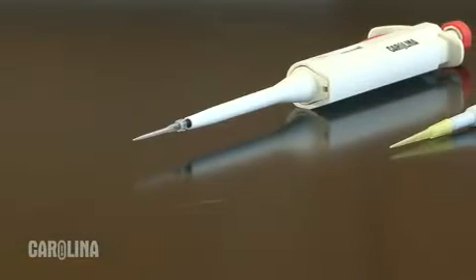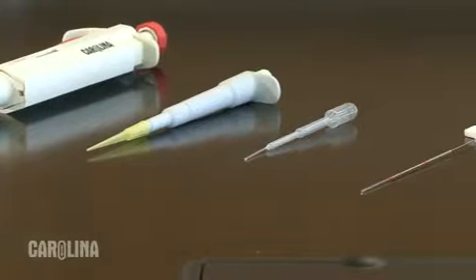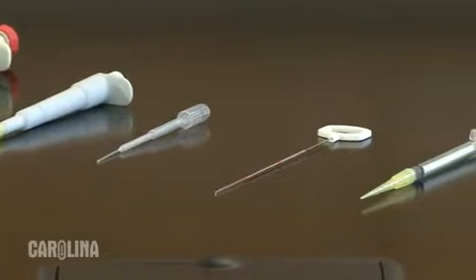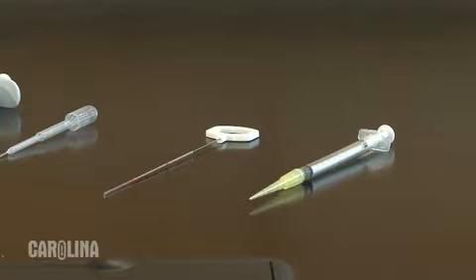An adjustable pipette, a fixed volume pipette, a needle nose disposable bulb pipette, a wire trawl, and a one milliliter syringe with rubber tubing on the tip. I will review the gel loading process with each of these devices.